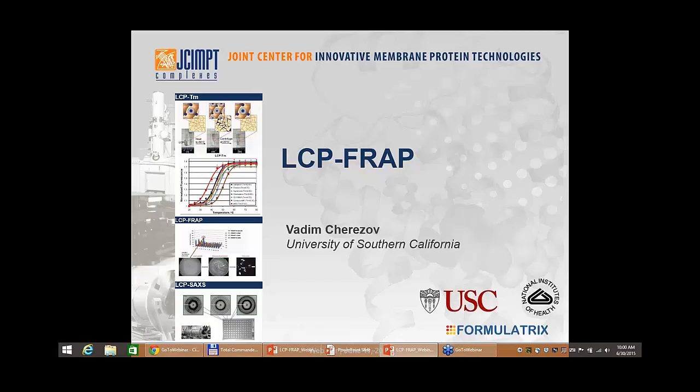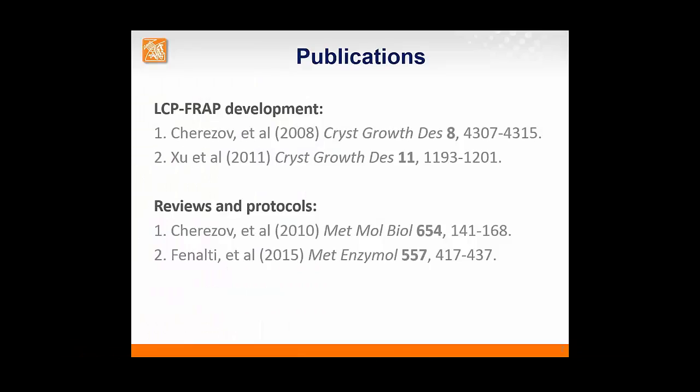This is a fairly broad topic, and we have limited time, so for the purpose of this webinar, I assume that the majority of the listeners know what lipidic cubic phase is, and that they use this crystallization technique for crystallizing membrane proteins in their lab. I also assume that many of you have the LCP FRAP instrument and have already started to use it.